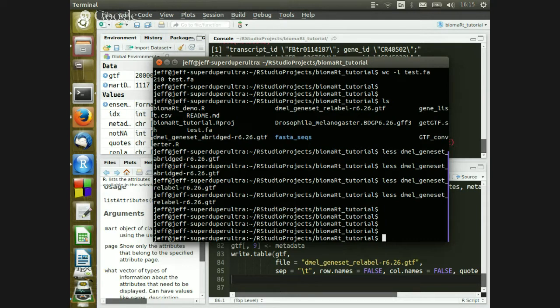Yeah, because I know you can attain the Go level, so you can get the child terms, but you're still going to get multiple different types of Go terms from that. But one thing you could do: Go is the gene ontology. One thing you could do is, when you retrieve that massive data frame that's been expanded into oblivion, get all the unique Go terms for each gene, and then you can play around.